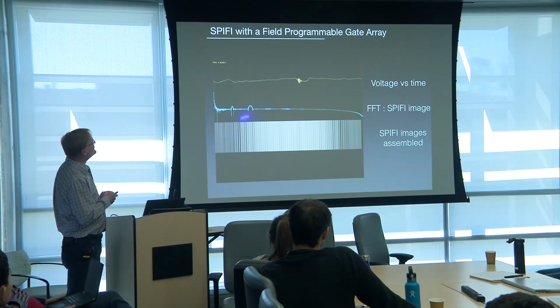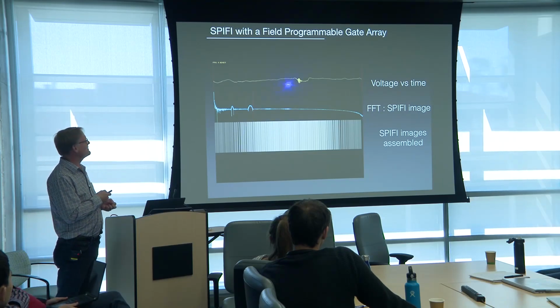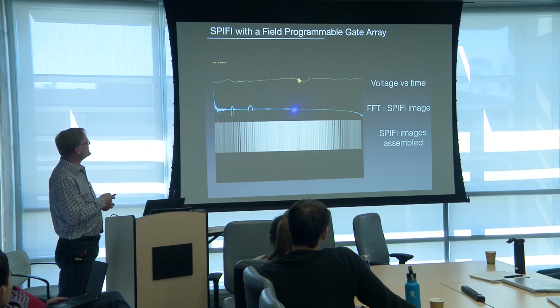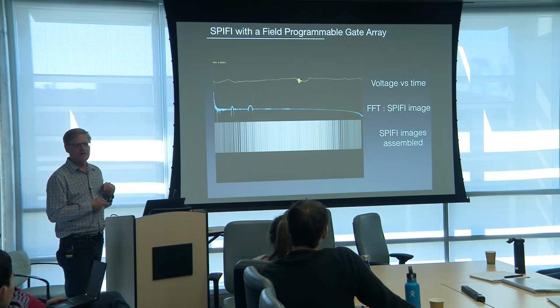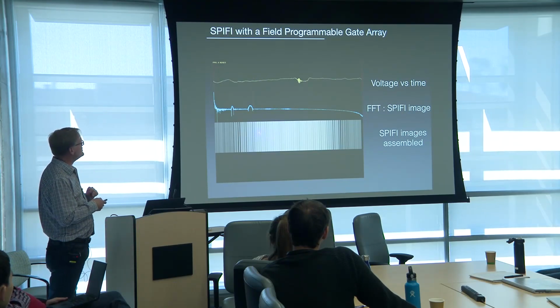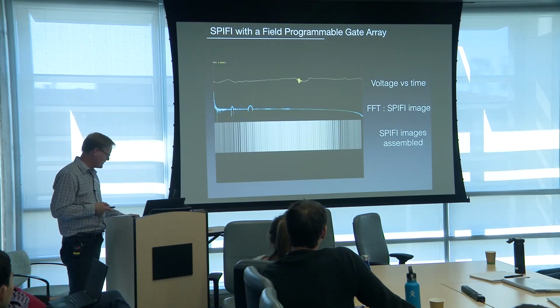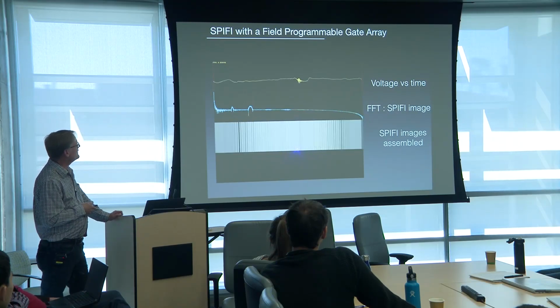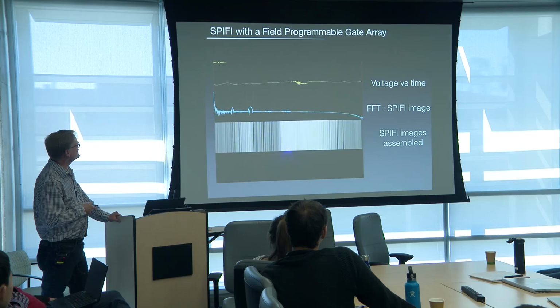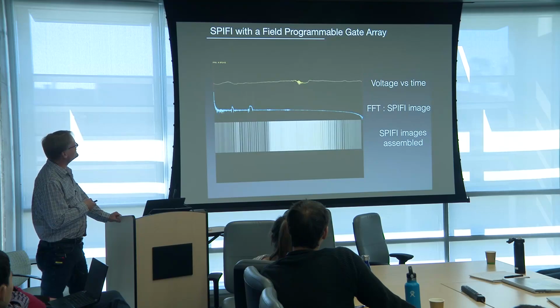And this is actually just showing you in linear modality what it looks like in real time. So there's the SPIFFI signal. There's the Fourier transform of it, and we've just isolated this guy, and we're going to try to make this an open platform so that you can just grab it and use an FPGA. And what you'll see is that we're going to just drag a wrench through it. And you'll see that the wrench here is resolved. It's got twice as many pixels. You can really see it coming through quite easily. Yeah, so you can see that's really much wider than this guy.